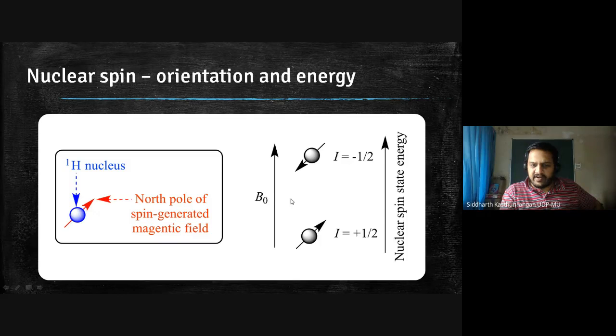So the spin up and spin down two states are there, and in principle, once I fix the magnetic field value, these two will have some energy separation. And if I then give a signal which has the same frequency, it will induce the particle to go from this state to this state, and I will find absorption at that particular frequency. And I say that nuclear magnetic resonance has occurred, and I record at which frequency it happened. This is the particular frequency at which nuclear magnetic spin resonance takes place.